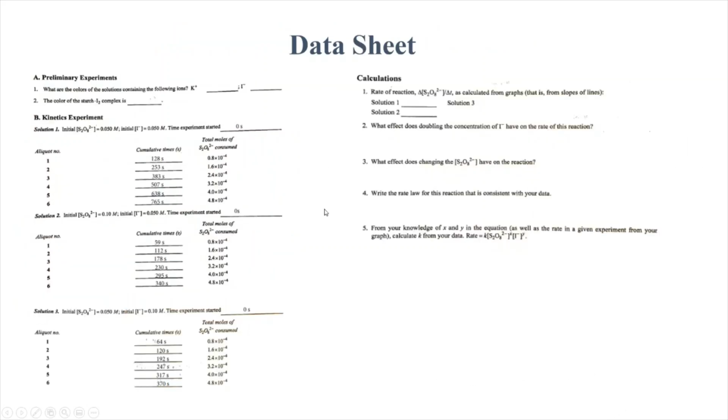Now if you look at the custom data sheet that we created for you, you're going to see exactly that. In trial 1, we observed this one. This week we actually physically watched it take place, and you saw how the data points were generated. Each time represents a time where the solution turned blue. And up here you can see that the calculations for the concentrations were already done for you in the textbook. They did M1V1 equals M2V2.